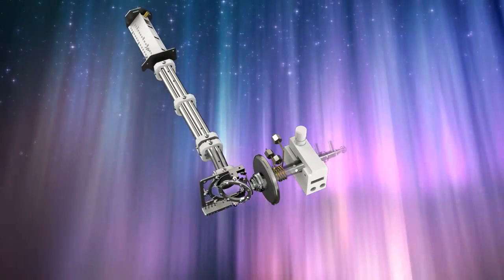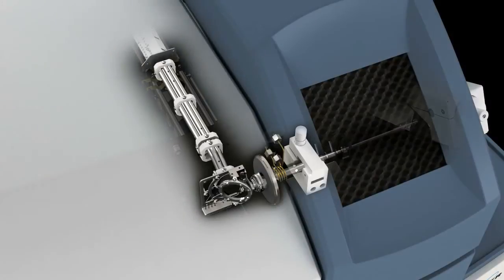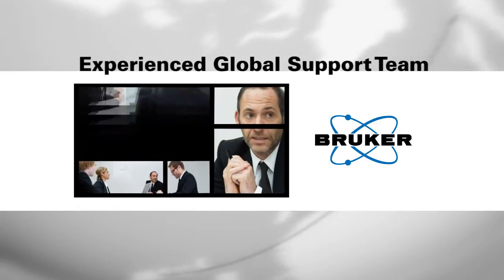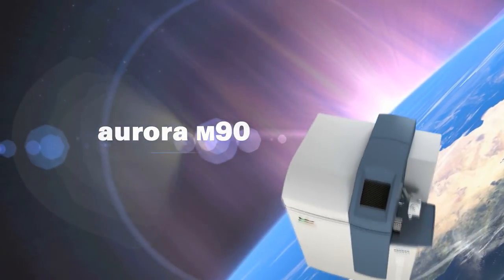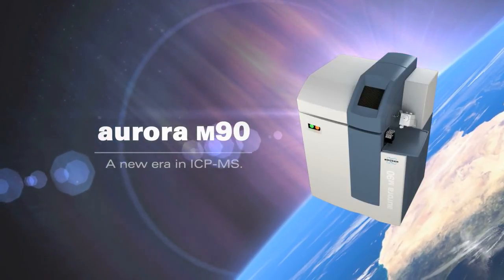The Aurora M90 represents the next generation in innovation and performance in ICP-MS with industry-leading ease of use. Bruker is world-renowned for providing systems that deliver excellent technical performance, backed up by an experienced global support team. The Aurora M90 continues these proud Bruker traditions and represents a new era in ICP-MS.